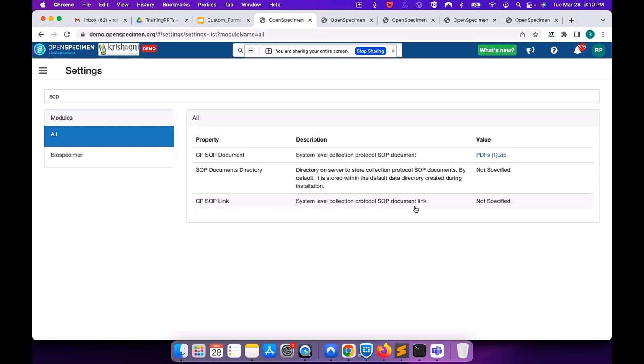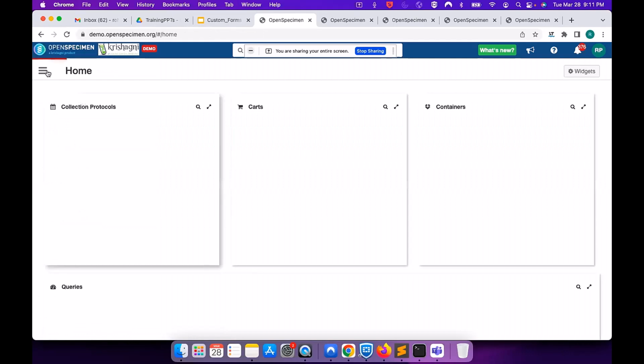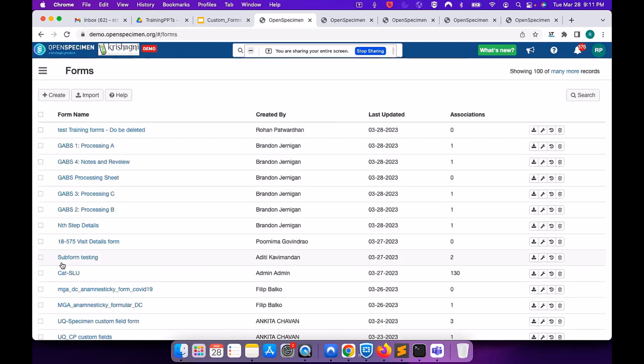Can you go over what happens with multiple revisions of the same form and archiving forms and things like that? Do you have any specific questions, or do you want a generic answer? Let's say that we start using a form in a particular way, and then we decide we want to revise it and maybe split it into two forms, make changes, and keep the old data but continue to use different forms instead.